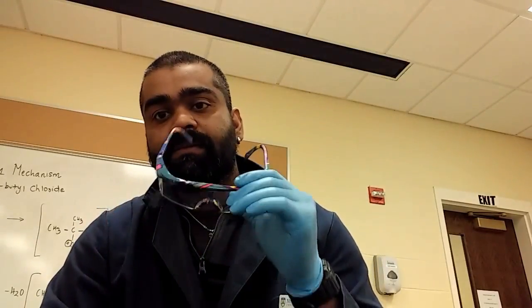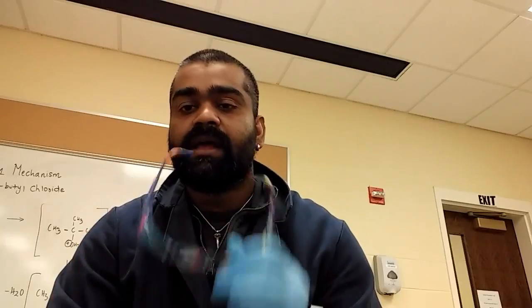So the key to success on this lab, if you want to finish quickly but be efficient, is that you need to not overheat the system too fast. Is that clear? All right. I'm going to stop the video here, and when I come back, I'm going to show you the reaction mechanism. It's probably something you already know, but it's a good practice to show the mechanism because we are doing organic chemistry. It's a good thing to know the mechanism. And then in the third clip, I will show you the reaction setup and what ingredients I have and what preparation I did before I actually started the experiment.